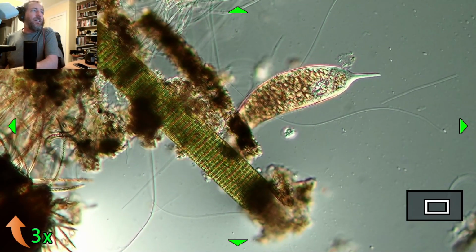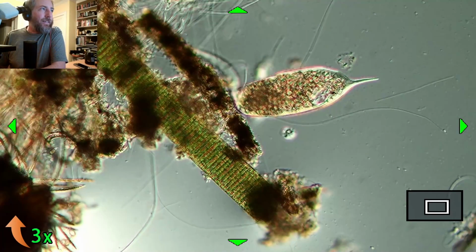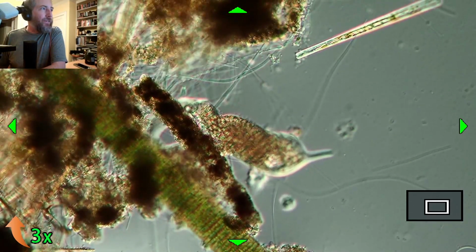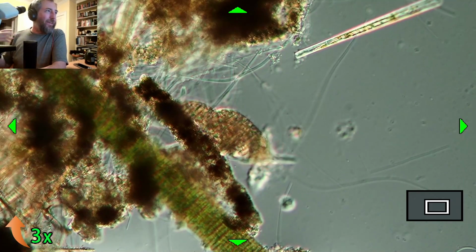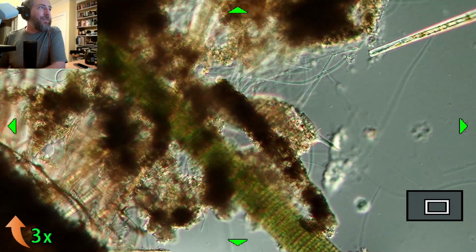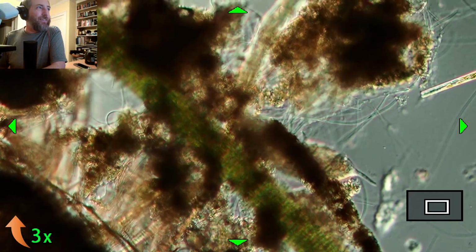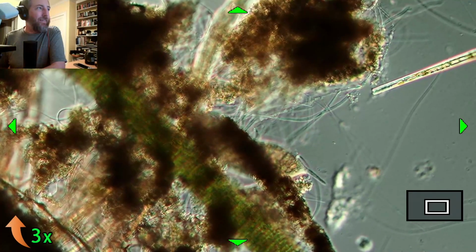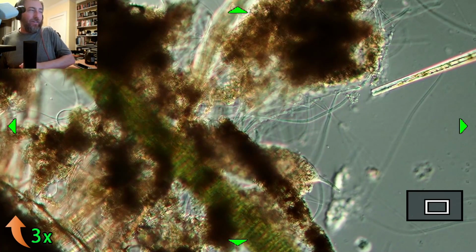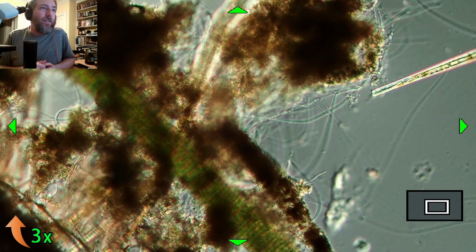You can see around the outside edge, it's got little cilia spinning everywhere. And it's got a tail, and it's got this big old neck. One of the things we observed on a previous stream is there's sort of a neck hole up there at the top of it, and it will open that up and try to swallow stuff. We've seen it try to eat things before. So these are predators moving around in this landscape. It's looking for food with its head. And that thing sticking off the front is like an elephant trunk in the way they use it. Their mouth is basically like a basket structure.